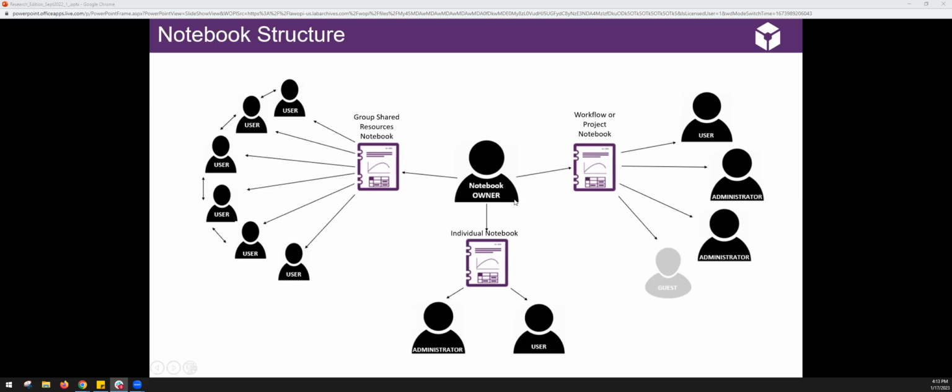But a lot of groups start out with individual notebooks. This is what Michele was describing. Each person of the team has their own notebook where they can add, edit, work. It's kind of their own place. It's sort of a professional portfolio. You know, day one of me at Weill Cornell, all the way to graduation day, all the way at the end of my program, in one organized place.